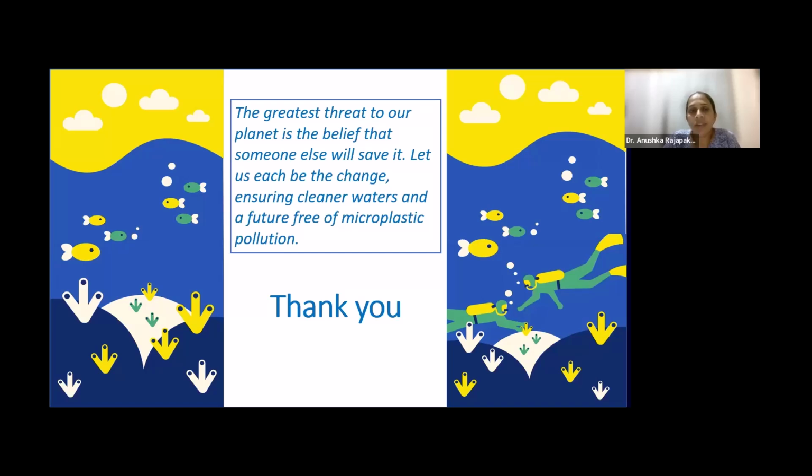Can we use DI water instead of RO water? There's a concern here as well. You should do a blank for the water. When we use plastic wash bottles, there's a contamination of at least 3 particles per liter. So you can use a distilled water blank. And each and every solution should be filtered with the same size filter papers before the analysis. Once sample preparation is done, we can filter, and then the particles are retained on the filter paper.